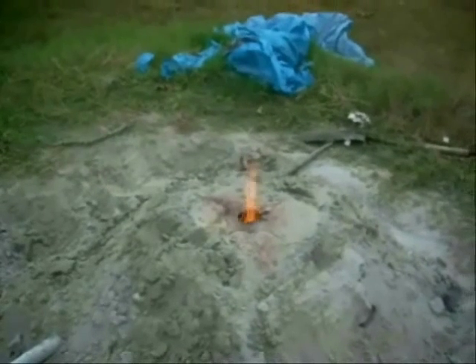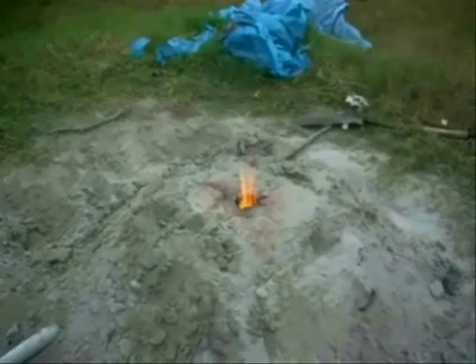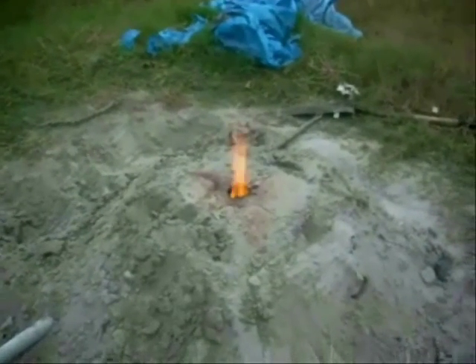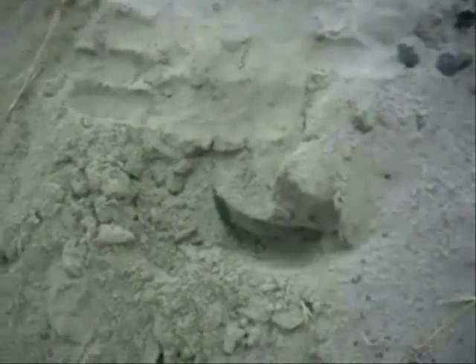After a few minutes of operation, the furnace reaches max heat, and then it's just waiting for the reaction to start. Down here where the receiver is buried, I've covered the receiver jar with the lid that's notched out to fit the pipe. If you just watch around this rim, when you start seeing smoke come out, that means the reaction is proceeding.